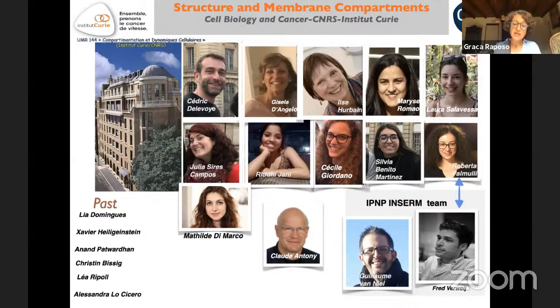Or, in the past, what people did was serial sections. This is still possible: you take the cells, you do serial sectioning, you go throughout the organelle, and you can then estimate the volume. But there are a lot of techniques.